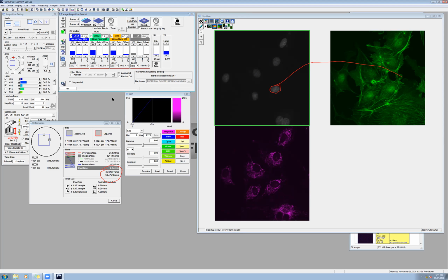So let's image and see if this even makes a difference. The other thing you can do is in sequential, you know that the problem channels are the blue and the green. So you can put this into group 1, and that will increase the speed. Instead of, let's say, 9.7 seconds, if you put this into group 1, it's going to take 6.4 seconds. Make sense?